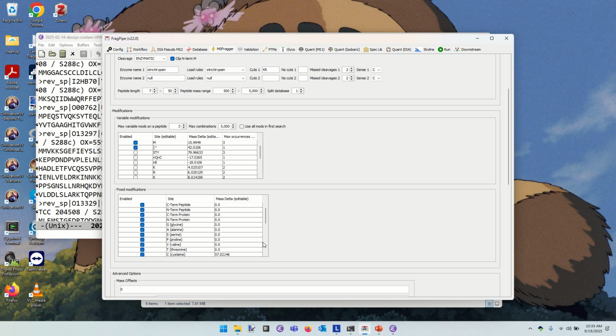But there's a little bit more to talk about on that score, and it's right here. These are fixed modifications. They are a different class than the variable modifications. Remember that I said we will allow methionine to gain 16 mass units? That's a possibility. But here we are requiring that all cysteines have a mass shift of 57 on them. This is very commonly the case in proteomics, and yet sometimes that's not the right mass to add.